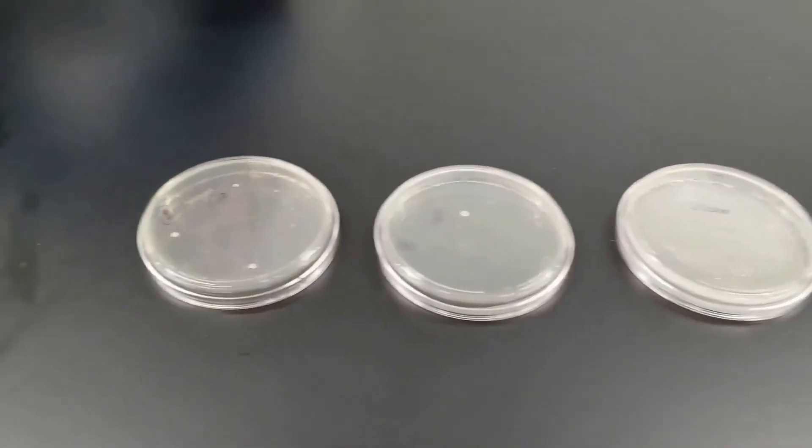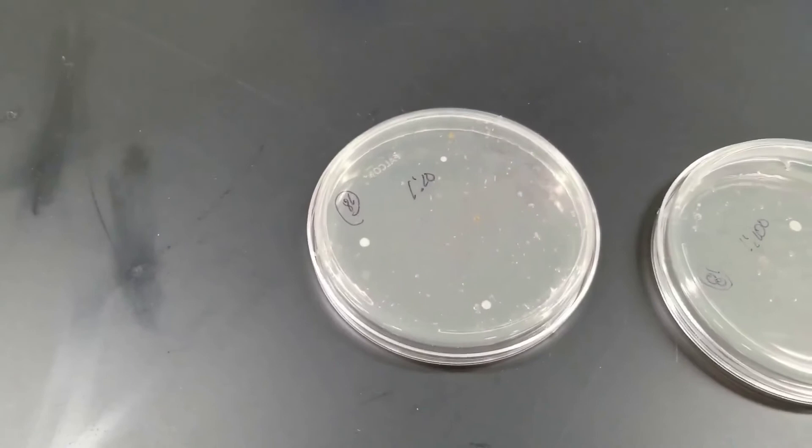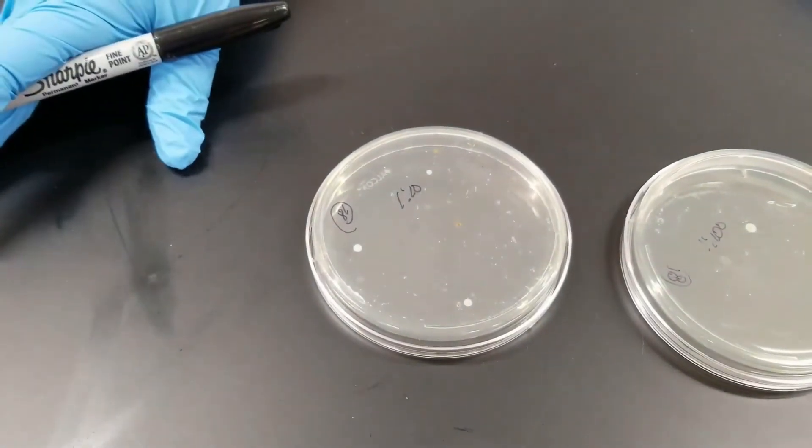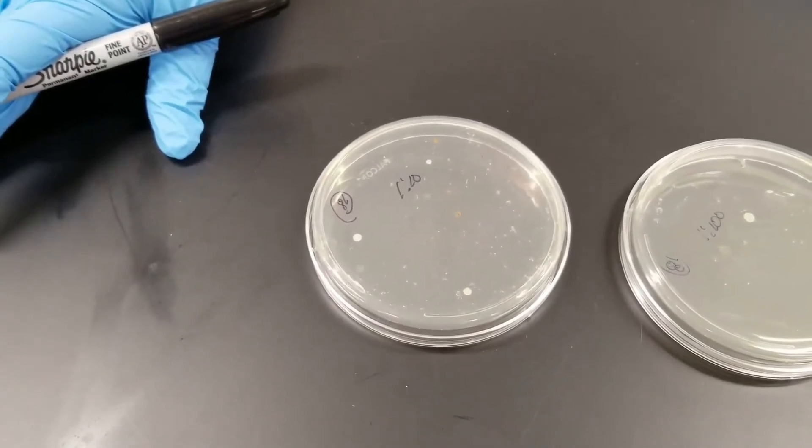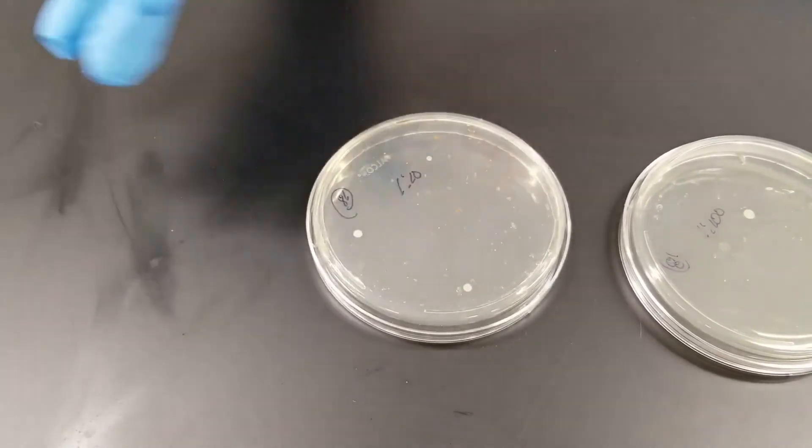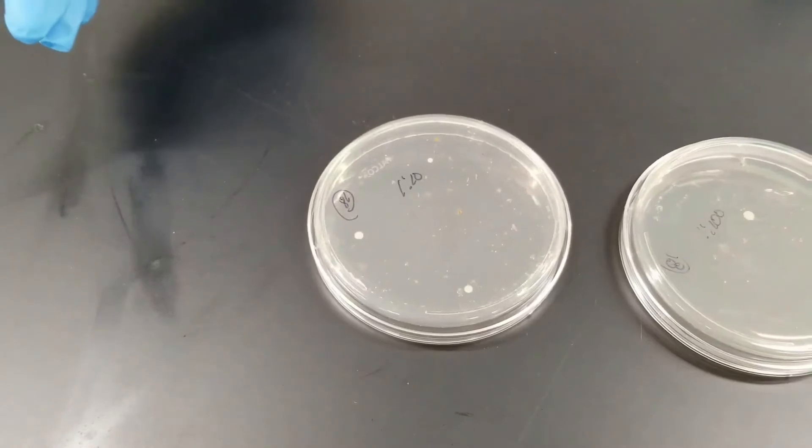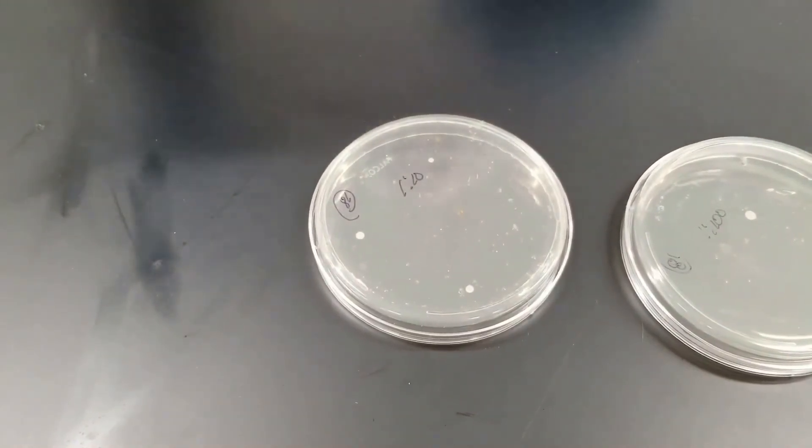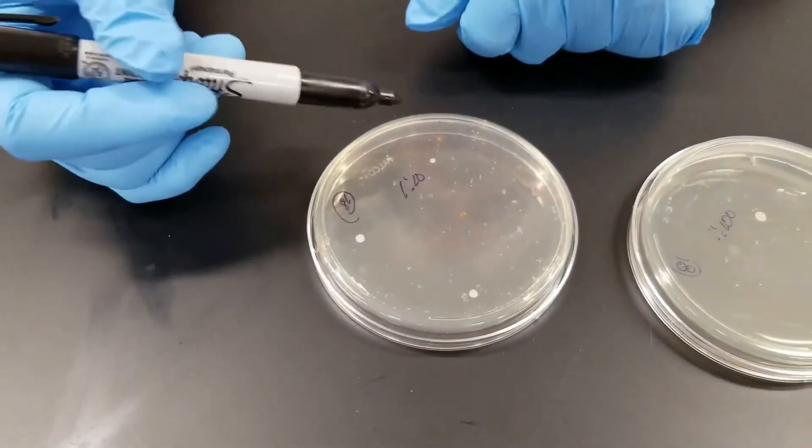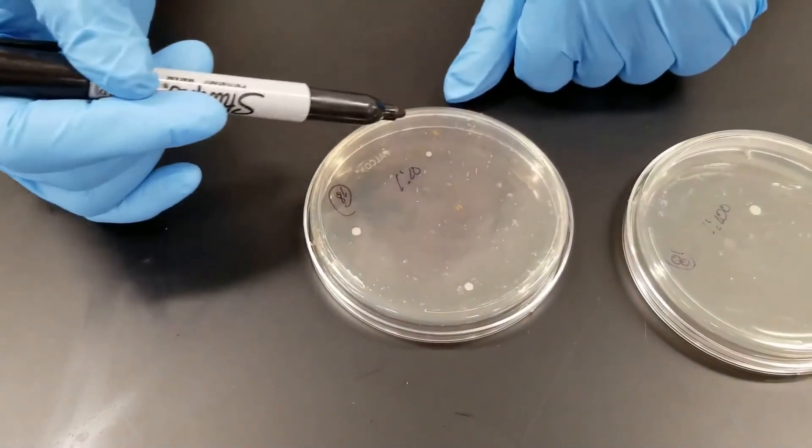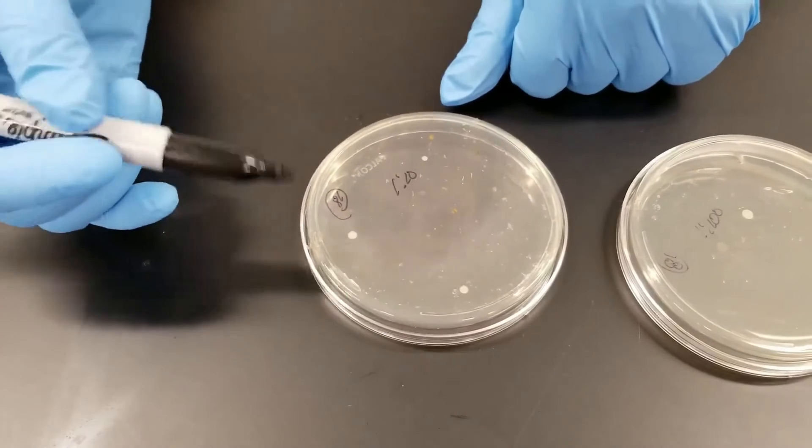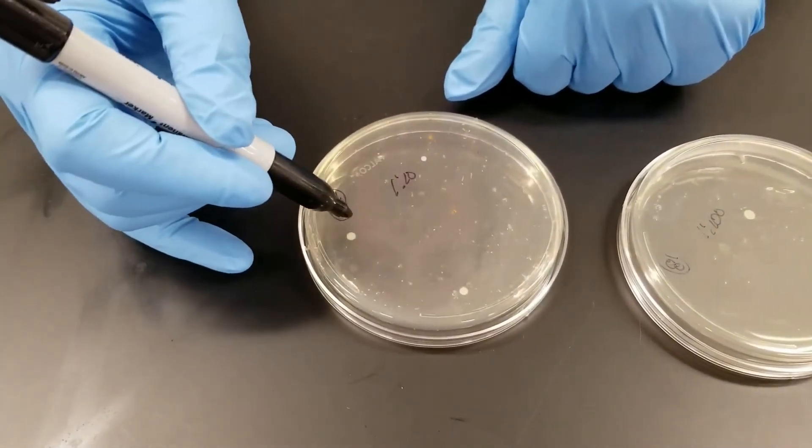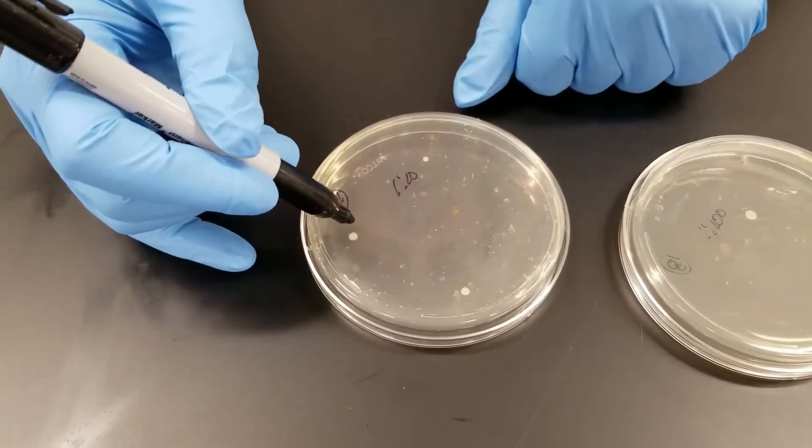So what you would do is go through and you would look. Some plates, if you had plated the strawberry directly on without diluting it, it would probably be overwhelmed with bacteria - it would be more than 300, which would be classified as too numerous to count. On this plate there are several different bacteria that are growing here. One easy way to keep track is if you take a Sharpie.